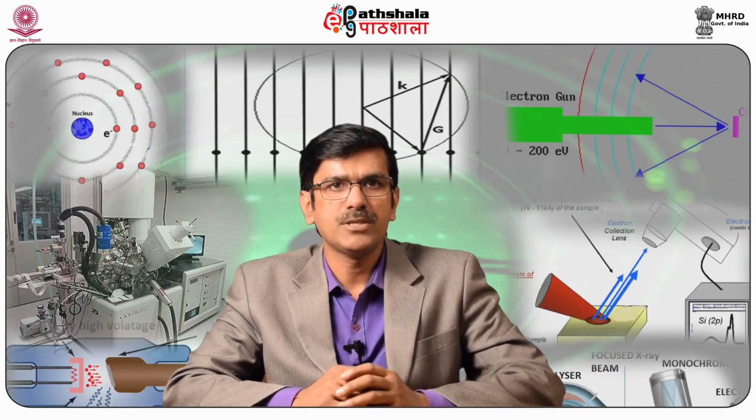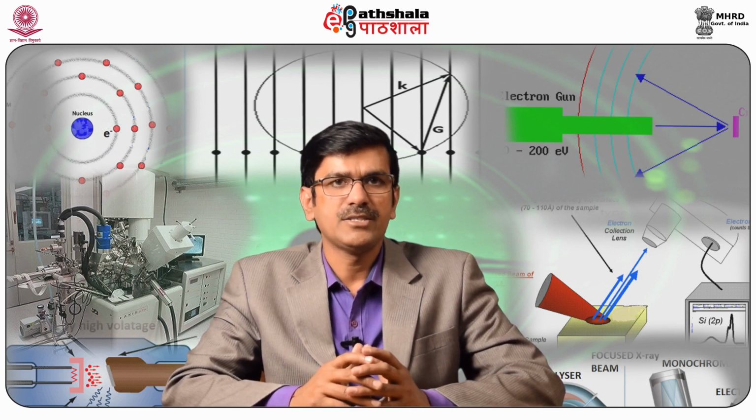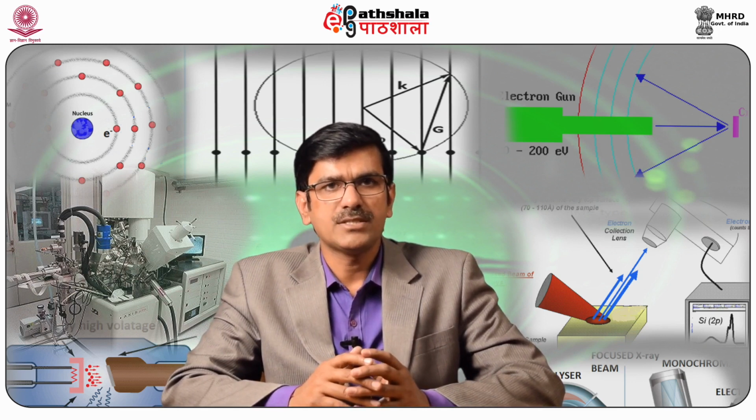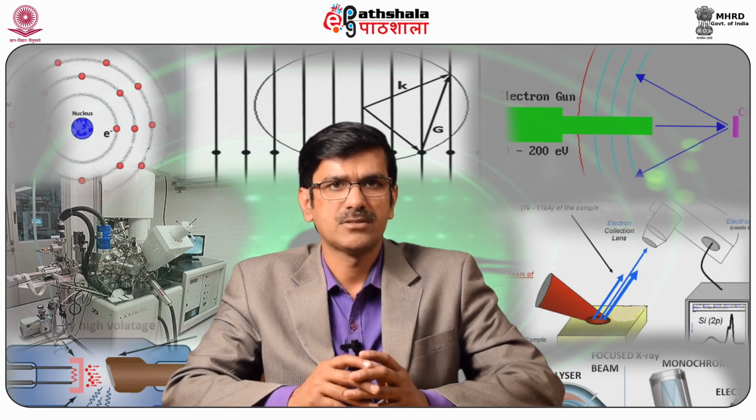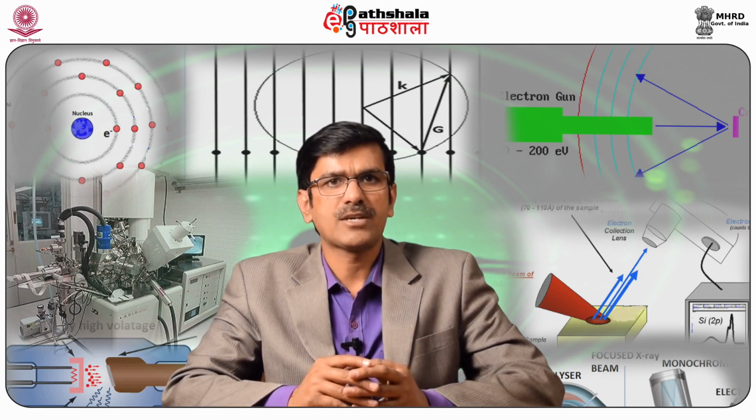Now about XPS requirement from the hemispherical energy analyzer. XPS requirement from the energy analyzer: the lower the pass energy, that is E0, usually the better the resolution of XPS, but improper values of pass energy and input-output slits result in spectrum shape distortion.